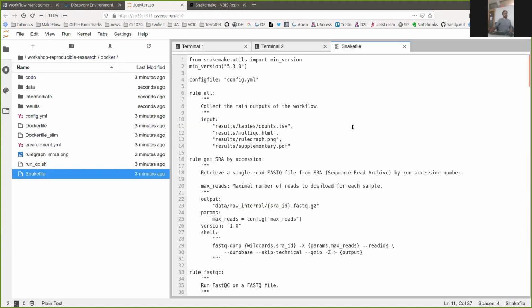Now let's look at the Snakefile and talk about some of the differences. You might notice that when we first ran our Snakemake workflow, we gave the target file that it was supposed to generate, like _a_b.txt.